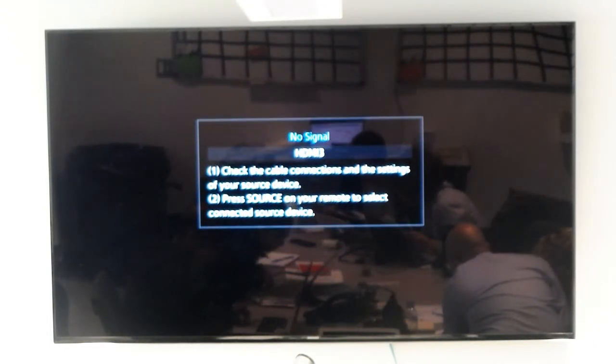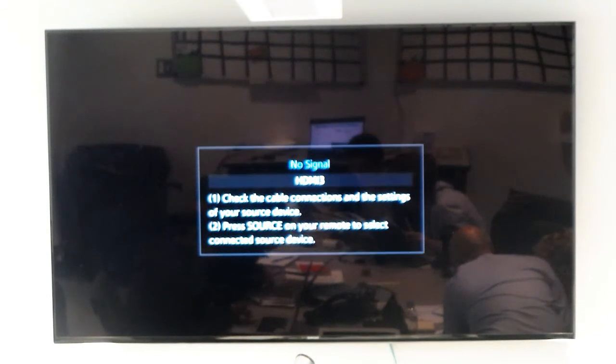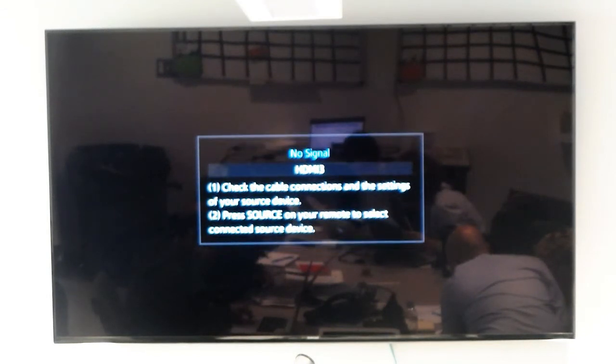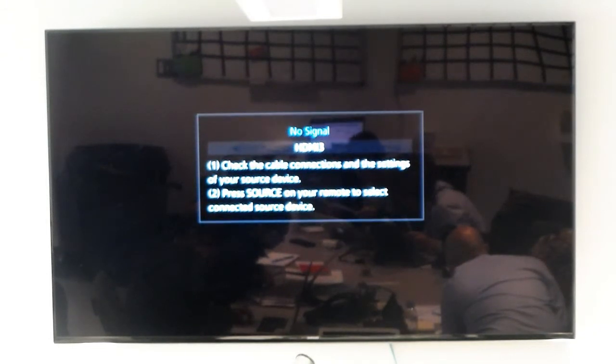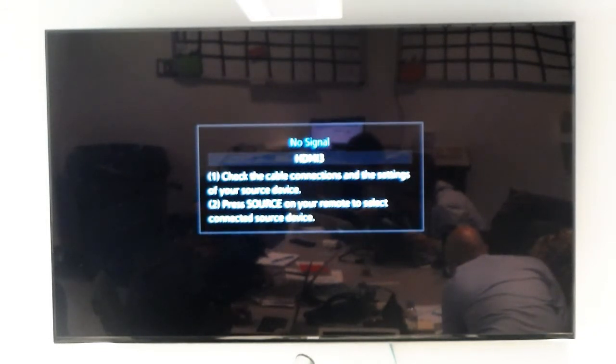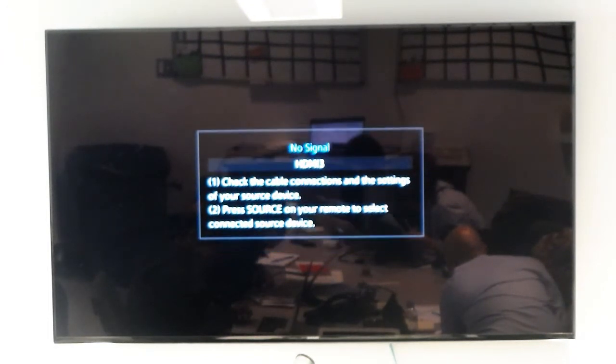No, the question is is it a GPU thing? Okay, now we, oh no. I think it's an MPI issue in this particular instance. And then just wait.